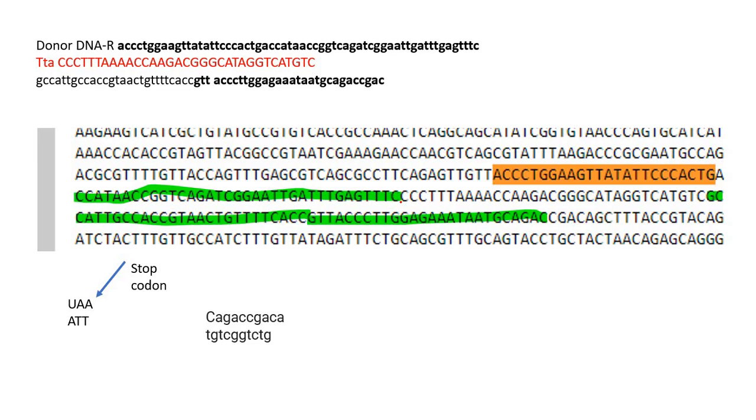And before this triple C, triple T, you need to delete this sequence along with your TTA, as you can see, it is the stop codon. Once you delete this and add this TTA, this is the 30 base pair sequence, so total is 200 base pair. From here to here it is 200 base pair.